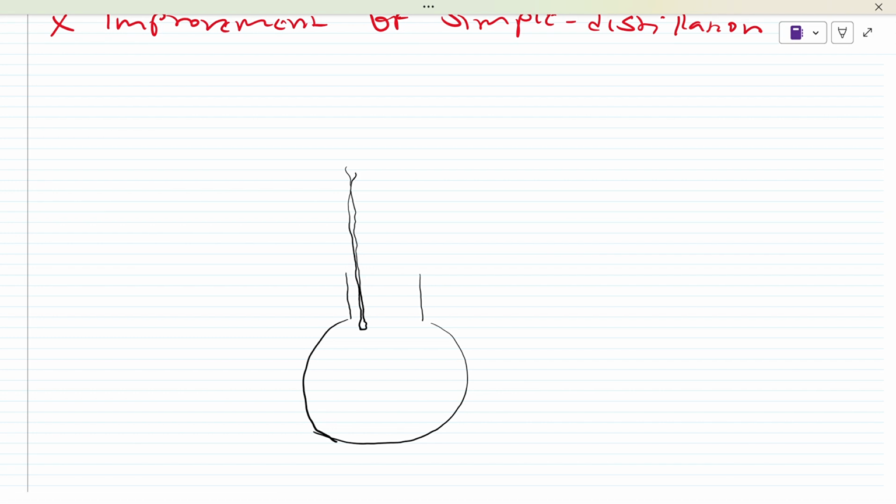Just trying to sketch. Sorry. On the other part, it's going to have a delivery tube.